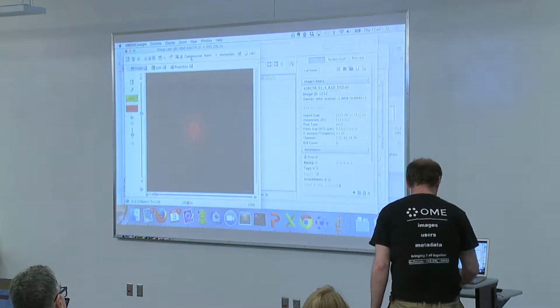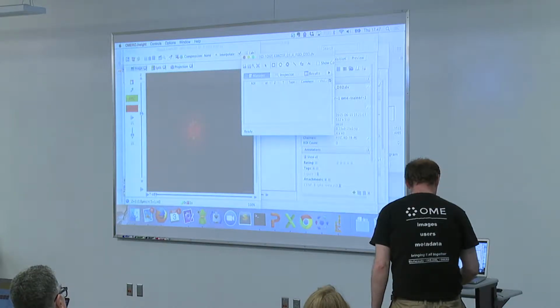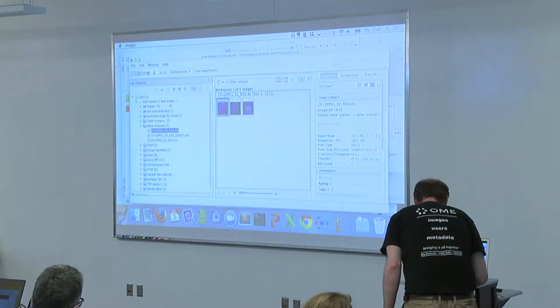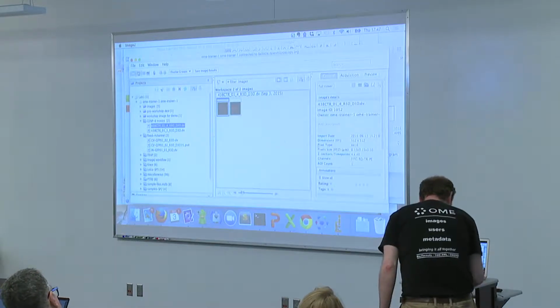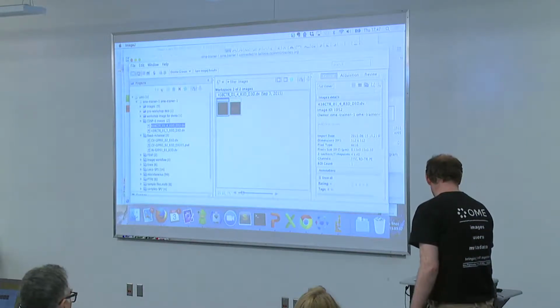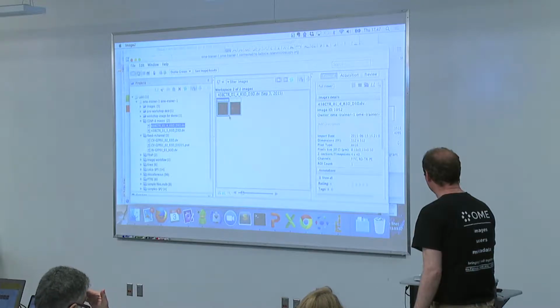Right. So we can draw some ROIs in OMERO. That's not a particularly nice one, but that will do. And then I have here a counter which says that there is one ROI in OMERO, but I'm now in the ImageJ plugin. Okay, I'm switching between the OMERO, which is this sign here, and the ImageJ, which is obviously known to you, and the plugin is run under ImageJ.